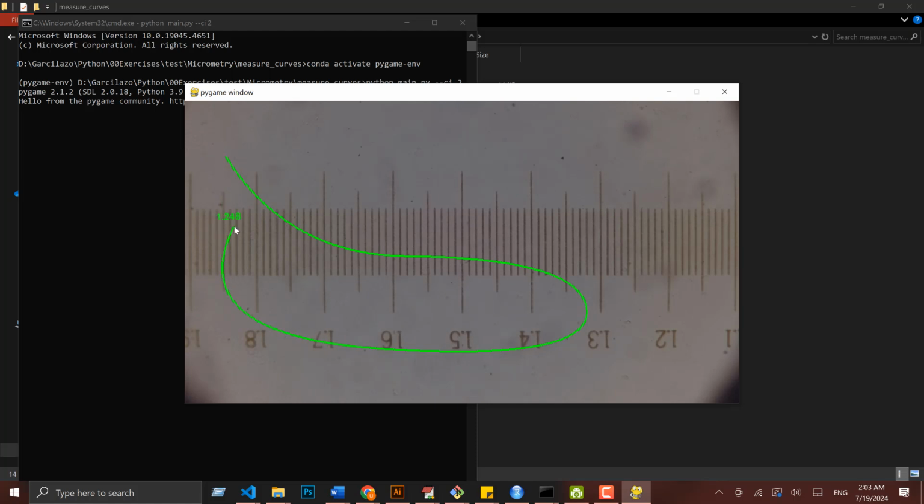Once I have it ready, let's suppose that I'm done and I don't want to keep adding more curves to this spline. I can now press the button D, as in dinosaur, and that is gonna confirm that the Bezier spline is done. Then, just like with the line, I can type the name, let's call it test, and then I can press enter.